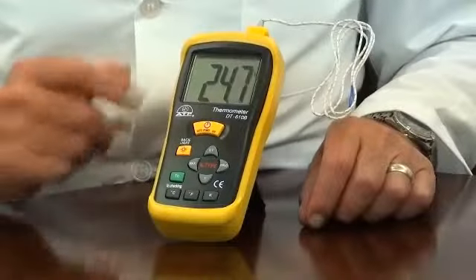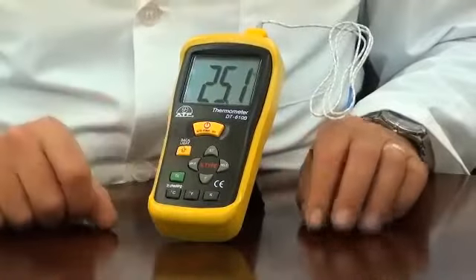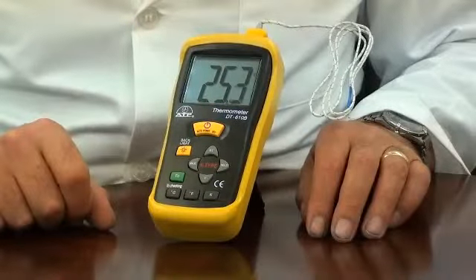The display is a large 45mm high contrast LCD with a backlight for applications in low light environments.